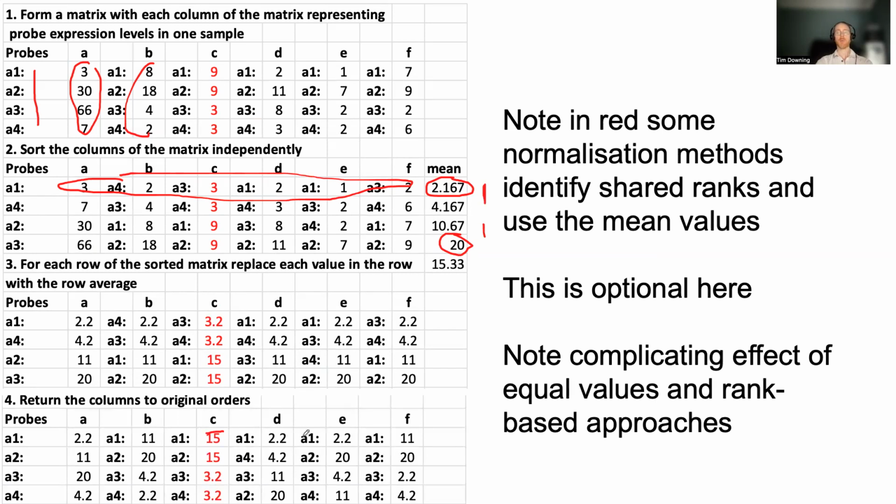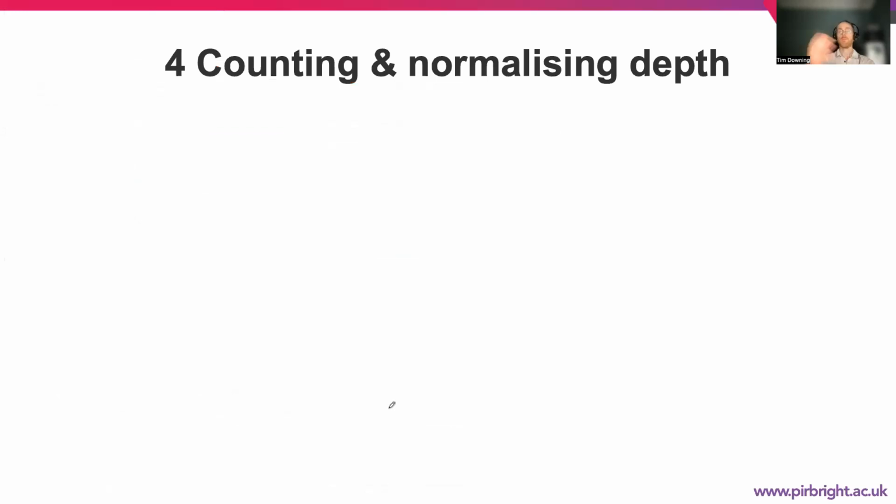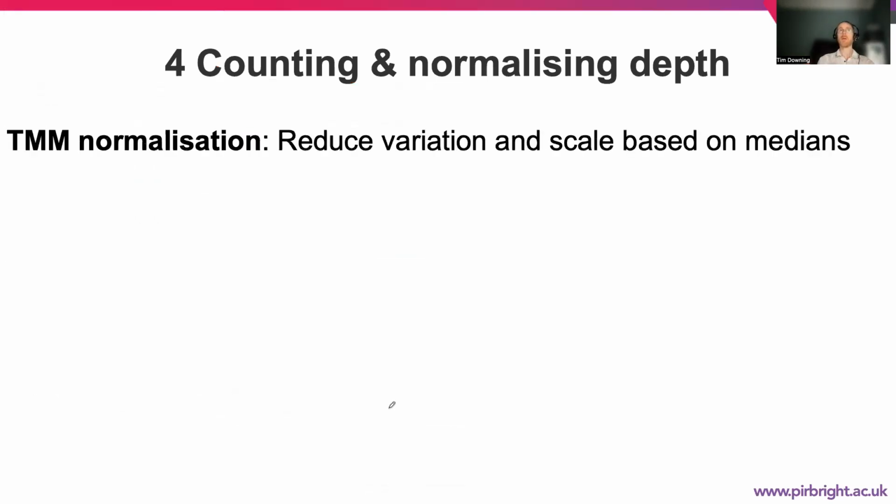This quantile normalization procedure has meant that we can compare these different samples to each other and see that the actual values we examine in gene expression experiments are not the original values because they're skewed by the library preparation approaches and the amplification process during sequencing as well. There are also other normalization approaches, many diverse ones that are not outlined here. One that's common in certain RNA-seq tools is called the trimmed mean of M-values. That's another scaling approach.